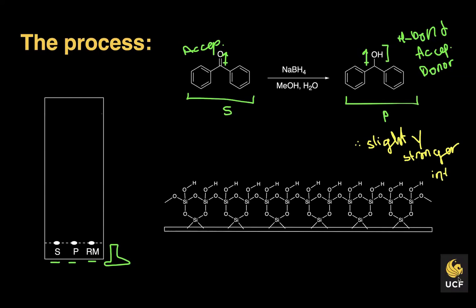And also another comment on just the relative affinities: not only is the OH an acceptor and a donor, if you look at the number of possible interactions that an OH bond can form versus the number of possible interactions that a carbonyl can form, the OH bond can form one additional bond. That is due to the 2 electron groups and the hydrogen versus the 2 electron groups on the oxygen. It's not a hard science. It's a relative scale, but it's a useful means of predicting where something should show up on your plate.